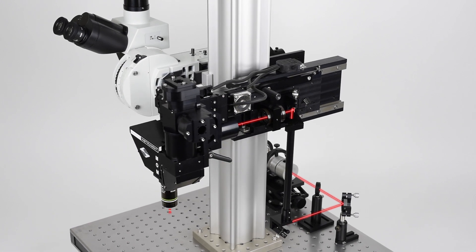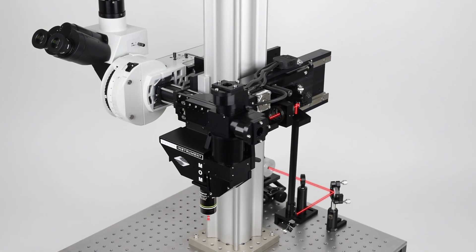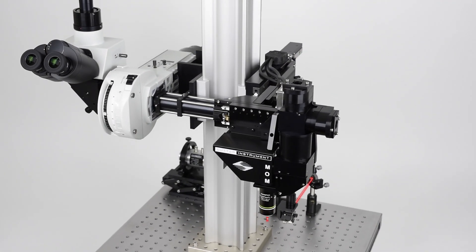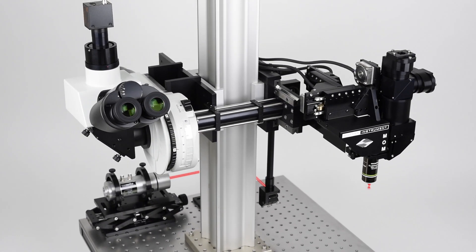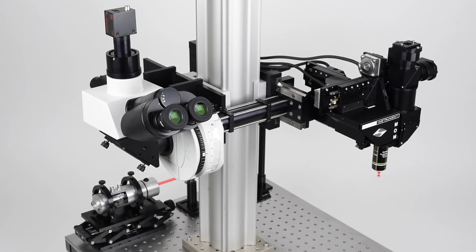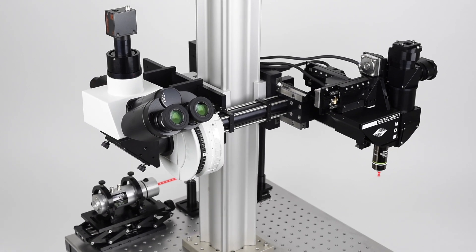On the other side of the microscope, the optional wide-field path provides additional ports for even more flexibility. This path conveniently accepts an Olympus BX51 vertical illuminator mounted to the system to facilitate the use of fluorescent filter cubes, eyepieces, and a camera. This is particularly useful for quick focusing or finding your position on a sample before laser scanning.